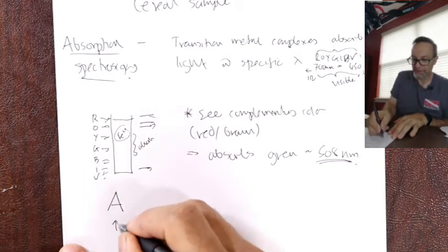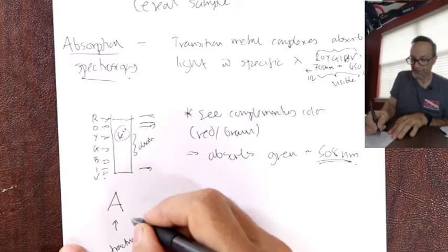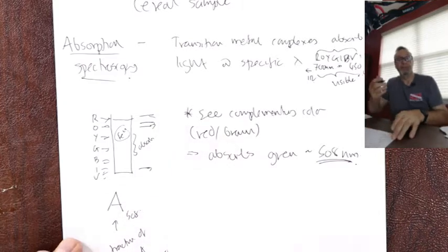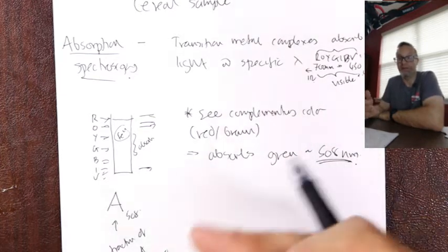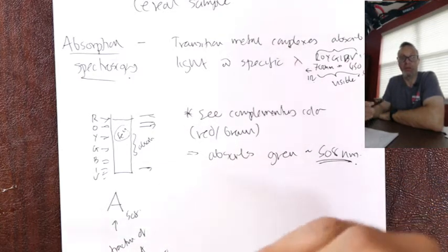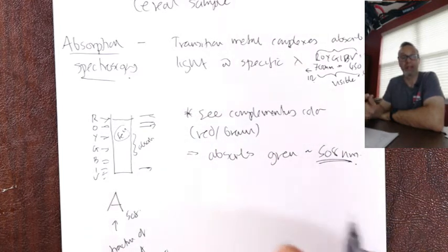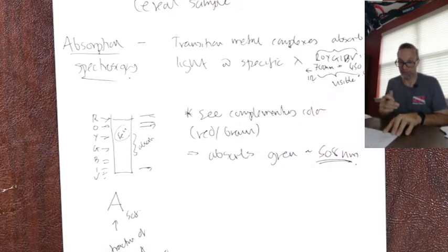Absorption, that's the fraction of light absorbed at a specific wavelength, 508 in this case. All right. So if I have absorption of 0, it's a window. All the light goes through, right? If I have an absorption of 1, it's a brick wall. No light goes through. So from 0 to 1 is the fraction. 1 is absolutely everything's absorbed. 0 is nothing absorbed. In our experiment, we get deionized water and calibrate for 0, and we'd find, hey, this is what 0 looks like, all the light going through, right? Okay, so 0 absorption, 100% transmittance, so that'll be deionized water, okay?